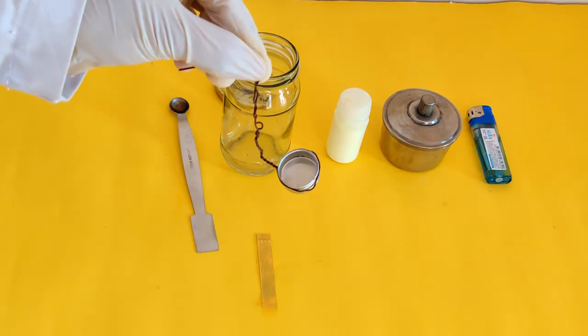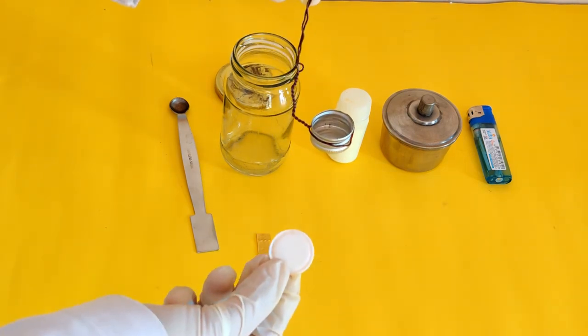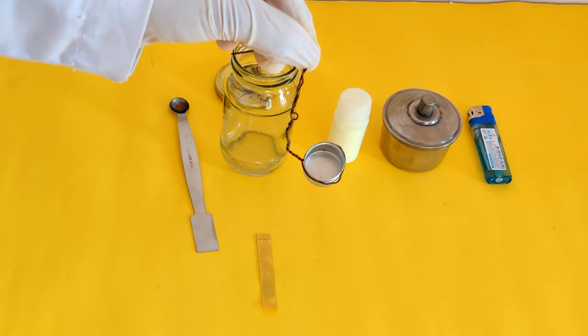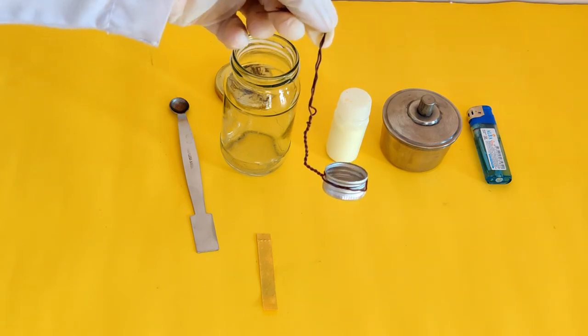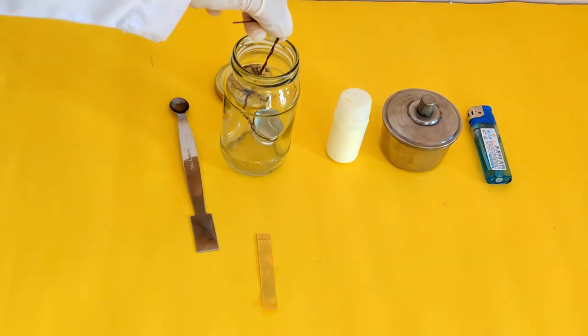Take an old medicine bottle or ink bottle cap made of metal to remove the rubber padding inside the metal cap. And tie a wire around it as shown, so that you can lower it into the glass jar.